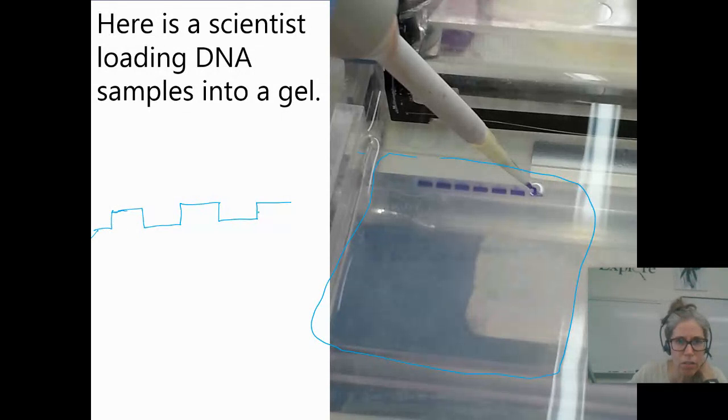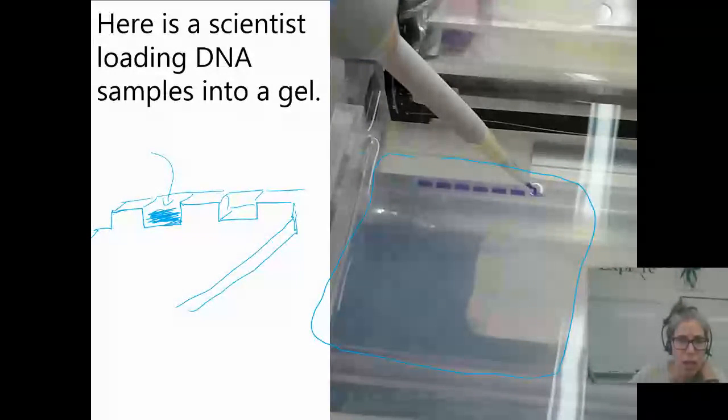So let's say here's the rest of the gel. It's got a certain thickness to it, and the wells sort of maybe look like that. So here's the well where you're going to put the DNA, but the rest of it is actually like an actual gel right at the top here.